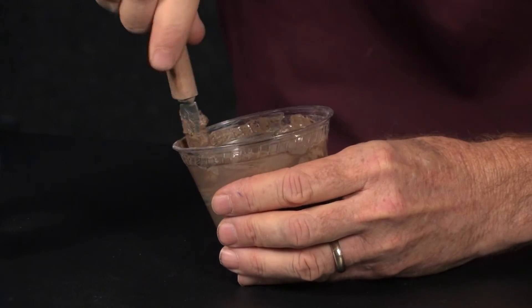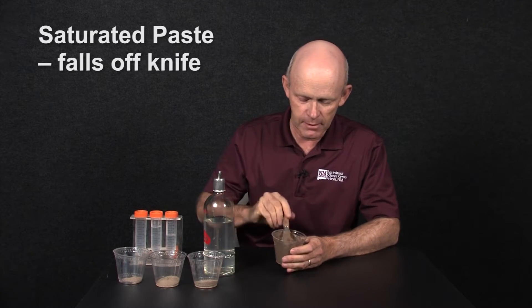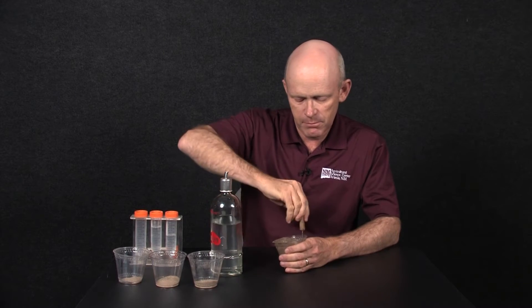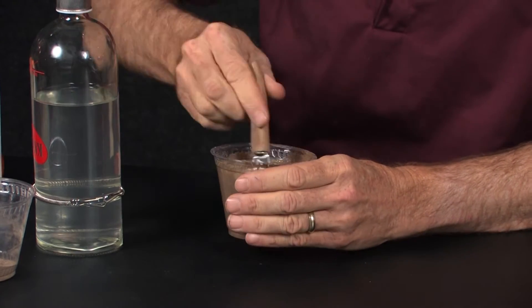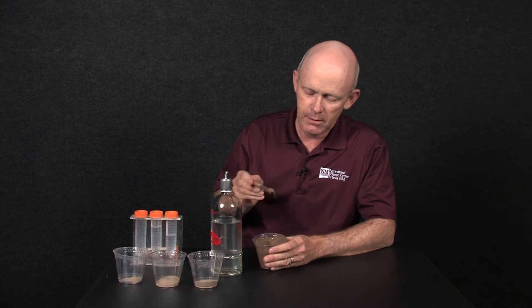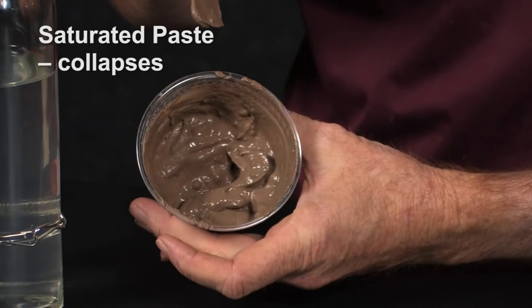As we mix it, what we're looking for is a soil that will fall off the knife — and it's not there yet. It's a subjective procedure, but when one person works on it, it's pretty repeatable. It needs to glisten, and also, if we make a channel inside the cup and tap on it, it should fall in.